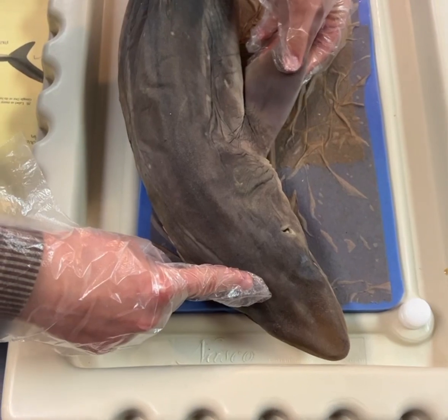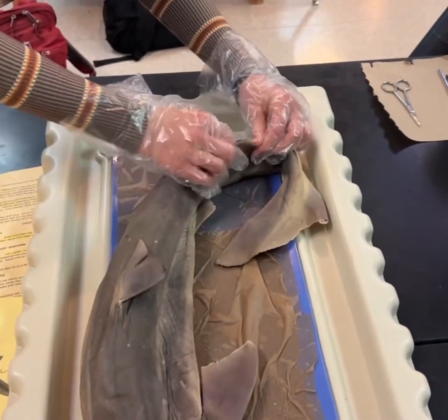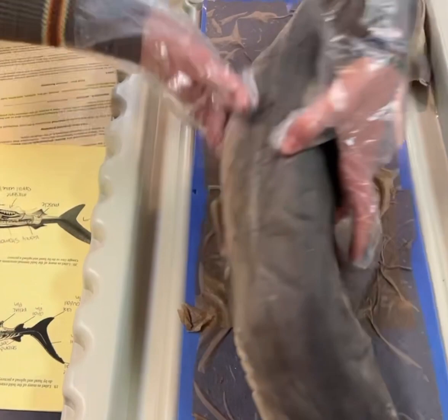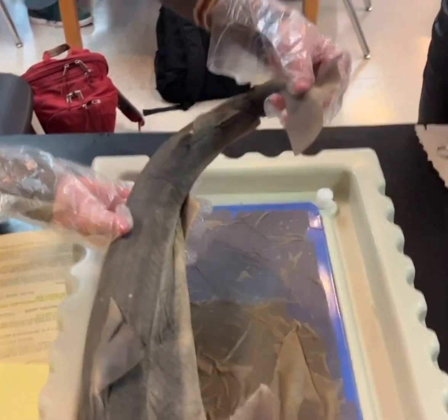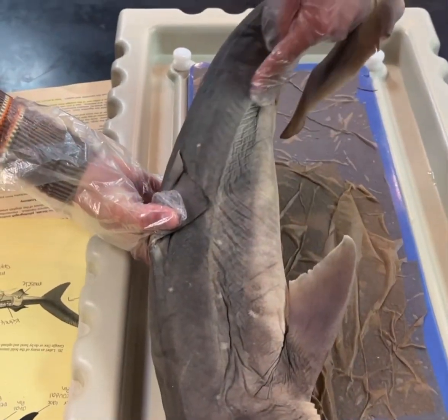And then this is her snout. This is her first dorsal fin. Down here is the second dorsal fin. These are the pectoral fins. Down here too. These are the pelvic fins. She has no anal fins, and this is a caudal fin. And her lateral line is right across here.